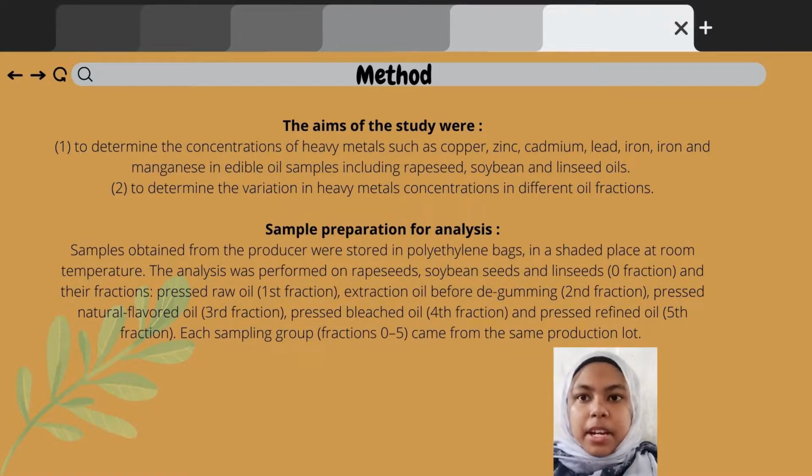For sample preparation, the sample obtained from the producer was stored in a polythene bag in a shaded place at room temperature. The analysis was performed on rapeseed, soybean seed and linseed and on their fractions.